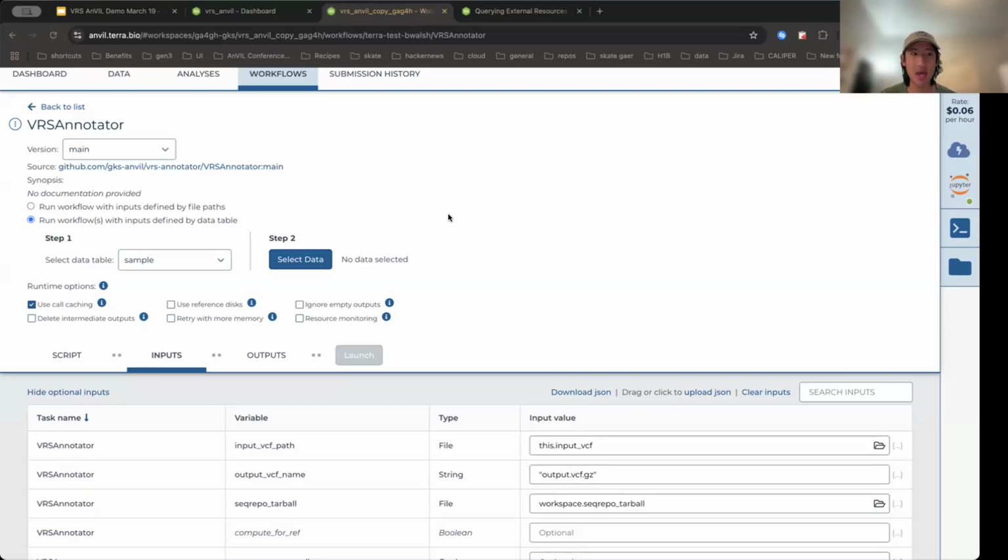The goal of that being to work towards that interoperability and make it easy to interoperate for any data set, regardless of whether you're working with a small amount of data or if you're working, on Gregor, with a lot of joint VCFs and many participants.